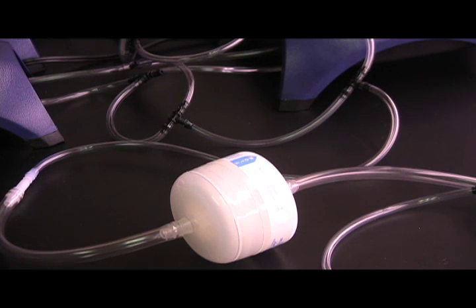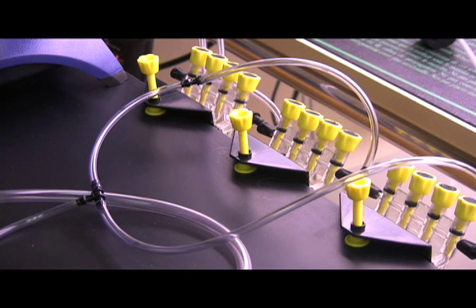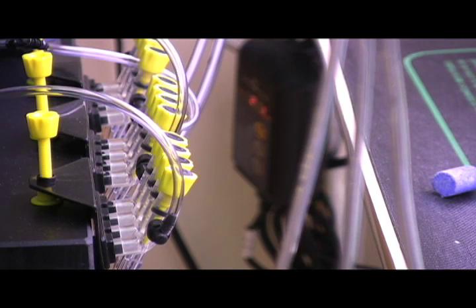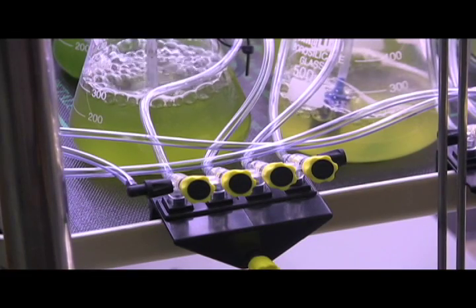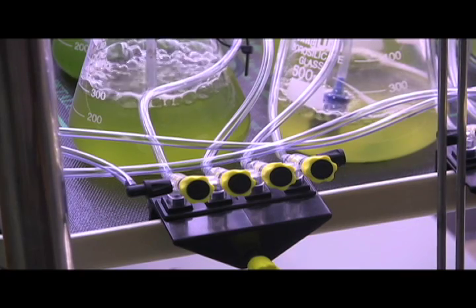From the filter, airline tubing was split twice to run into three gang valves. The gang valves further split the tubing by a factor of four, each of which ran into another gang valve. From these gang valves, airline ran directly into our systems.